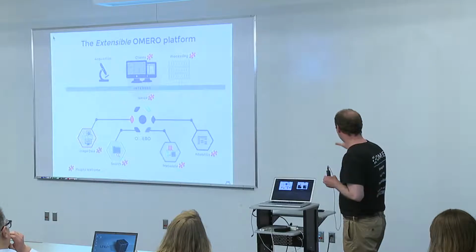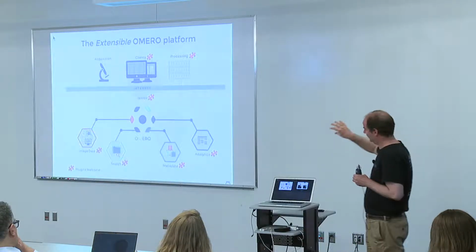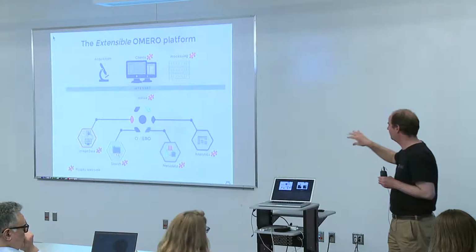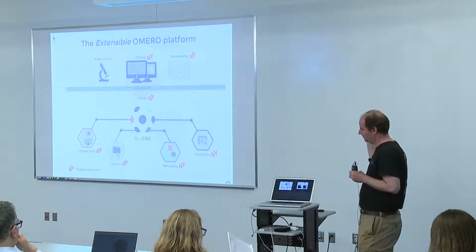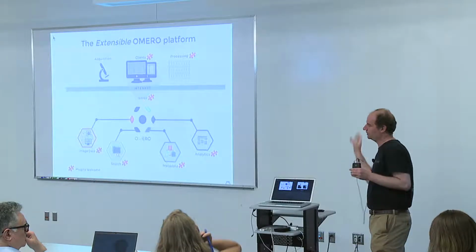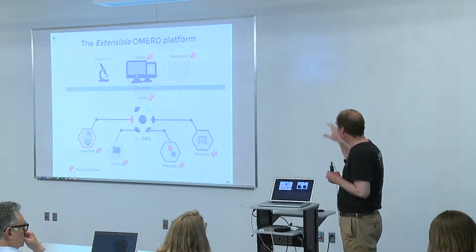But just so that you know what is going on here, in order to get the workflow facilitated, which I just highlighted, we have a server-client application. So OMERO is an image management platform. It's a part of the Open Microscopy Environment, just like Bio-Formats is, which you should certainly have heard about.